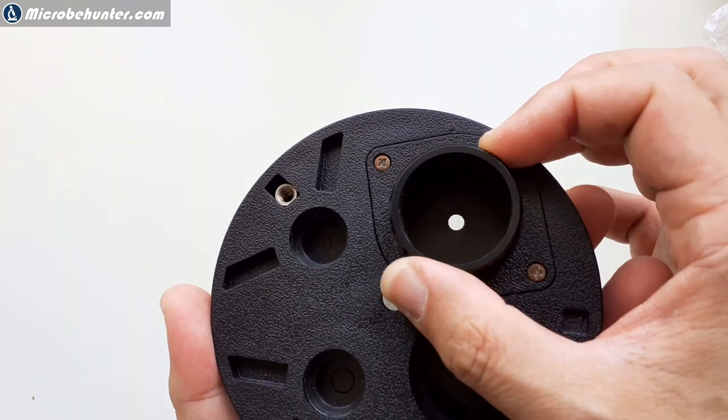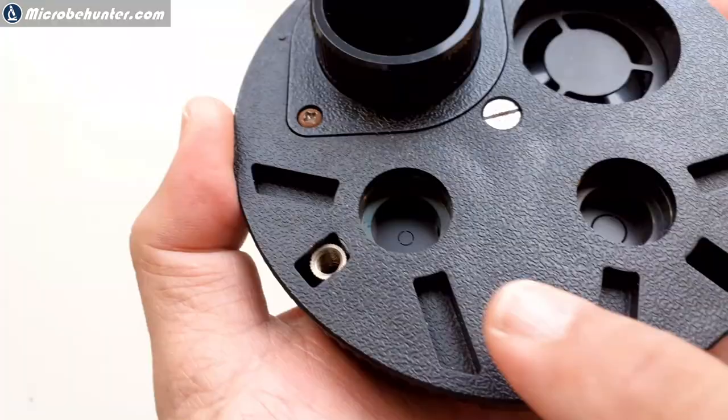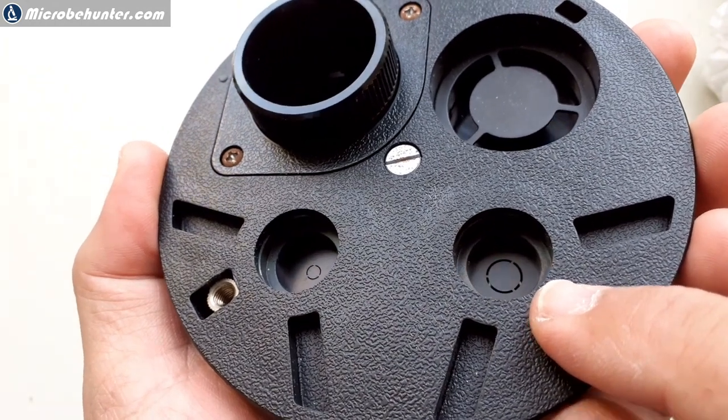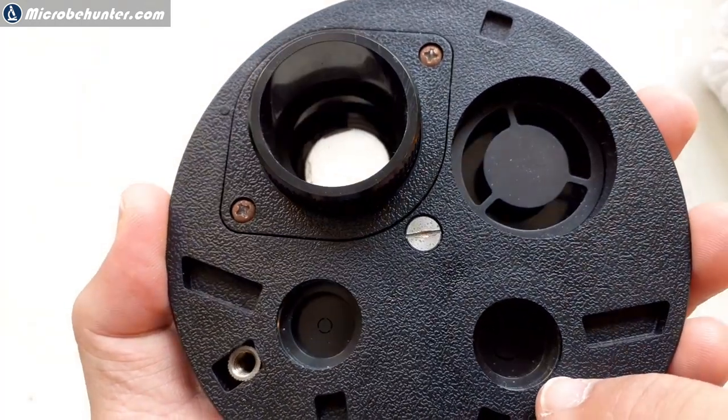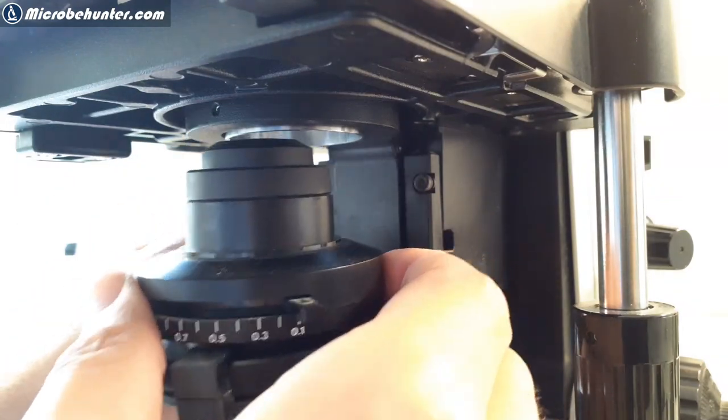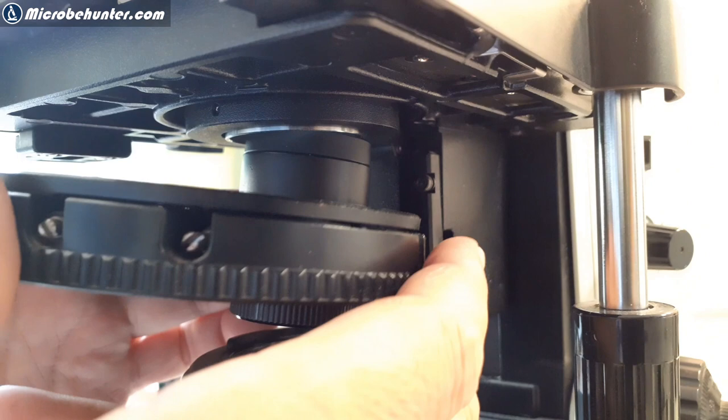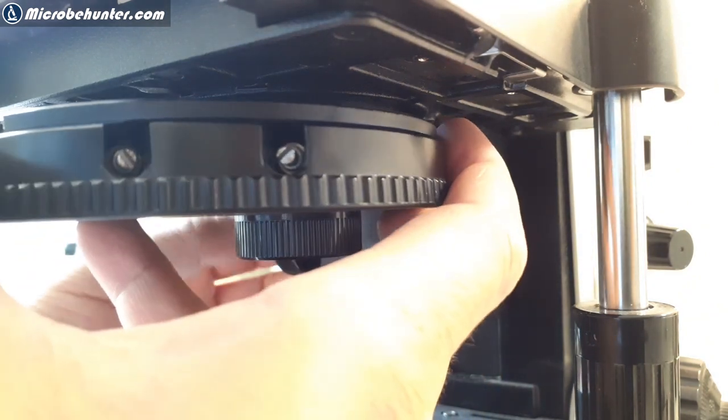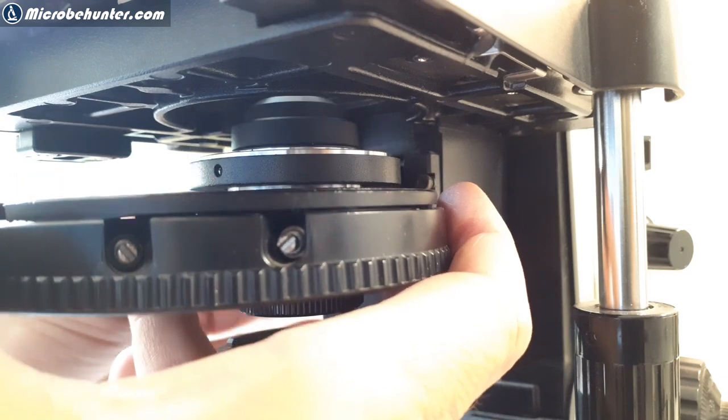These were the screws for centering, and this now is the condenser aperture diaphragm. Here are the phase annuli for the two different objectives, and there is also the dark field patch stop. I'm now removing the old condenser and I'm putting in now the new one. Now you can actually see the screws for centering of the condenser much better.